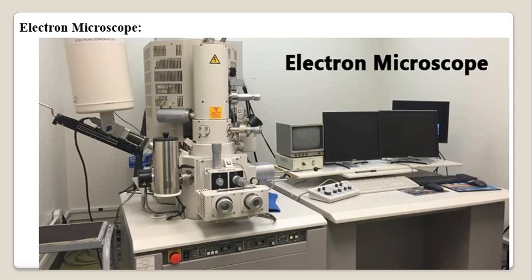So today there are several types of electron microscopes available for the cell biologist. Both the light and electron microscopes are similar in arrangement and in the functions of their components, and consist of three major systems, right?